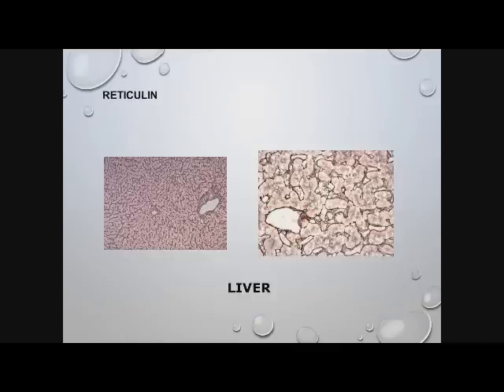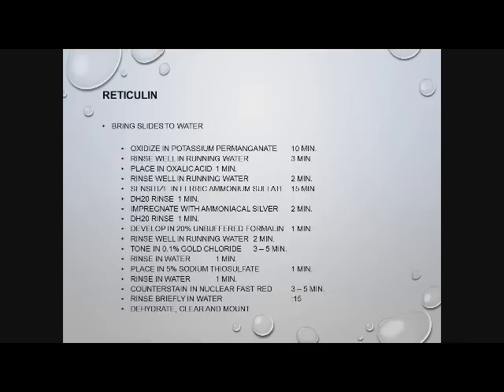Here are pictures of it in the liver, showing the reticulin fibers and a slightly red background from the NFR. There's the procedure, fairly long. A lot of people now do these on closed system stainers.